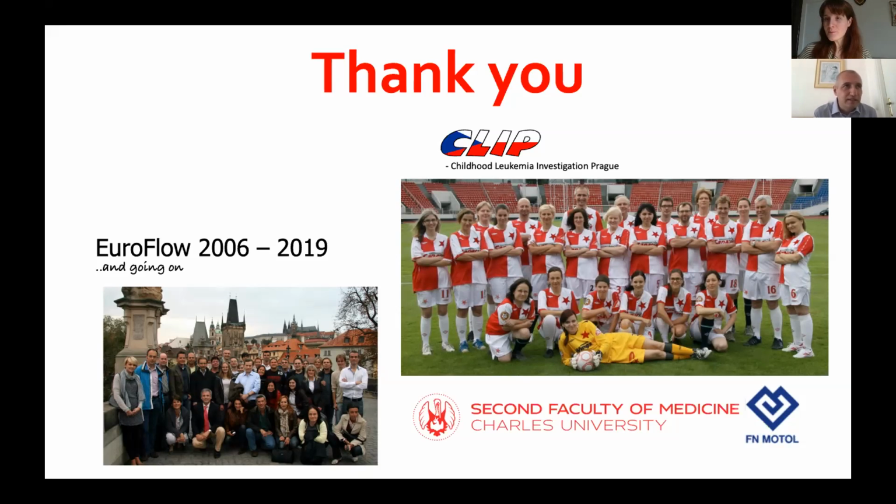So I have tested several assays that we brought from Canto to Lyric, which is the same type of detection, but with slightly more advanced electronics. We took them over to spectral cytometers like Sony, which is PMT based, and Aurora, that is APD based. And I can say this much.